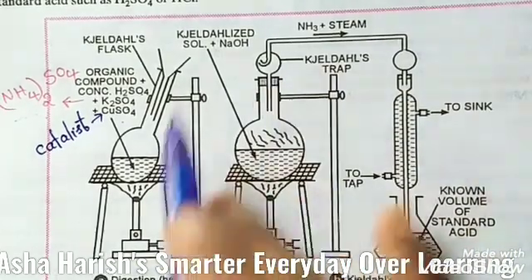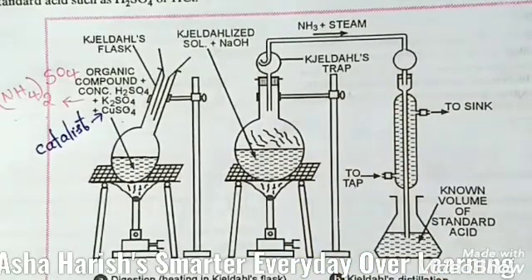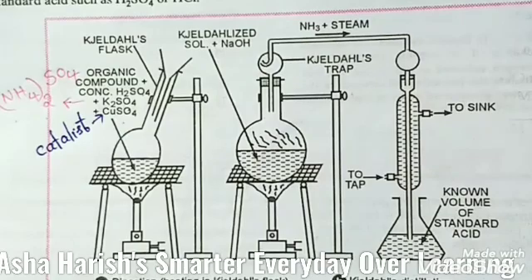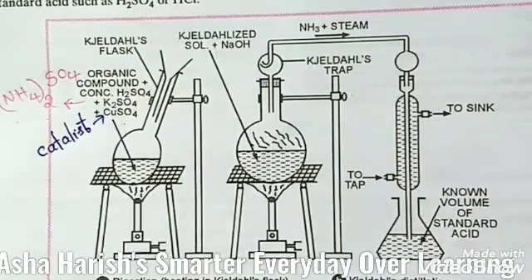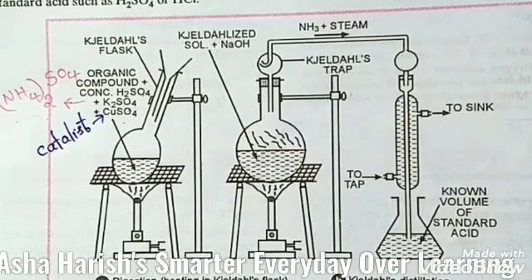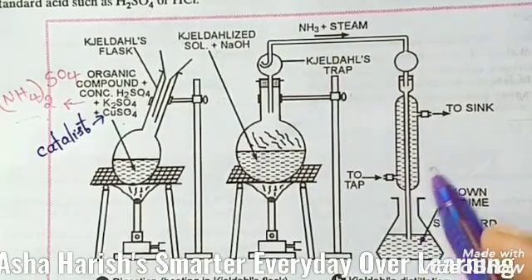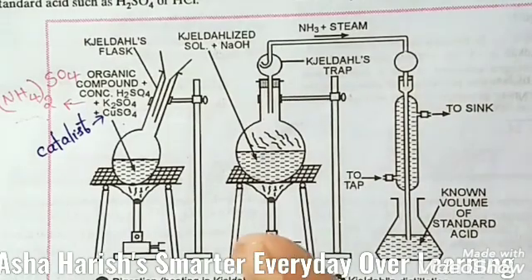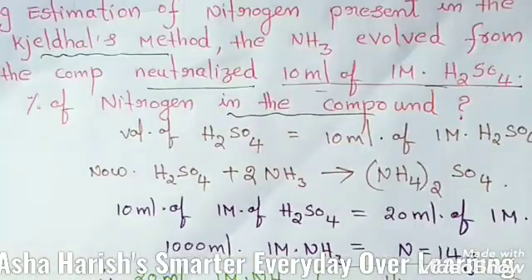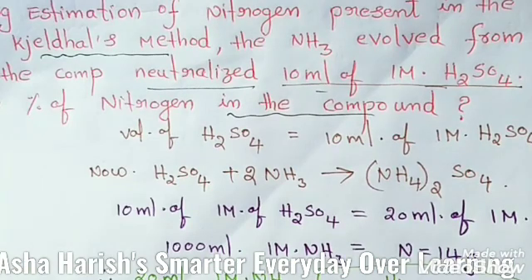Now this apparatus, the complete activity, the animated part, let's see. Then you can understand very clearly. Okay students, after you understand this class, what is your view and opinion, you have to tell in the comment section. Now let's see the animated part of this Kjeldahl method.